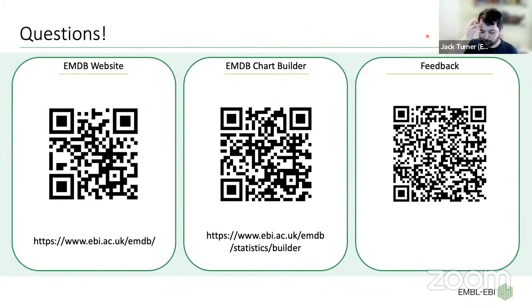Okay, this is good to know. My background's cryo-ET as well, so I can appreciate having to have that metadata. So yes, I can feed that back to the EMPIAR team as stuff that needs to be considered as mandatory. Of course, there is the other side to EMPIAR as well, where now it accepts so many different methodologies. We haven't really had the chance yet for someone to go through and determine exactly what should be mandatory and what should be optional for each of these methodologies. So this is something I can definitely feed back as requiring review. Thank you.